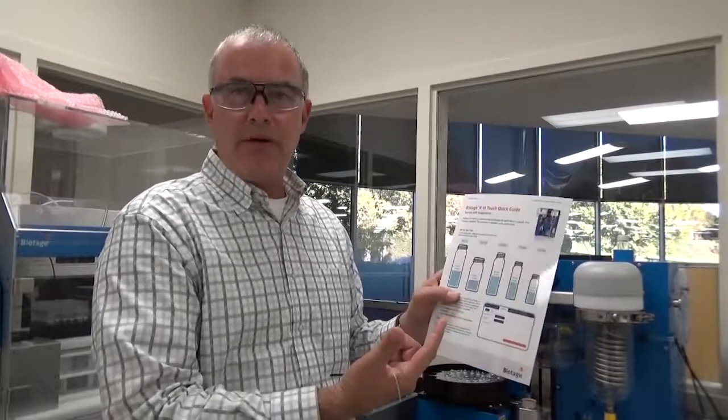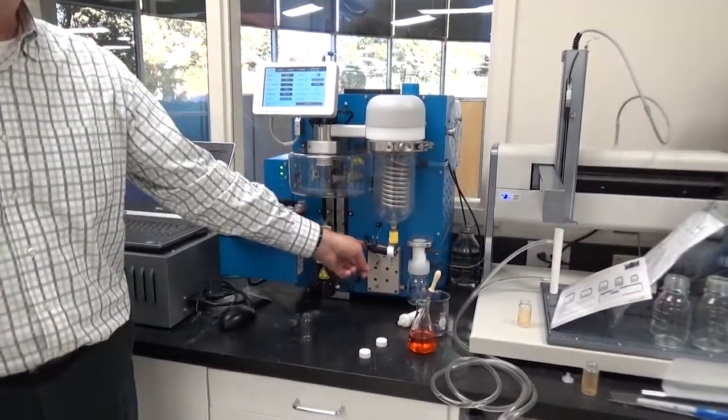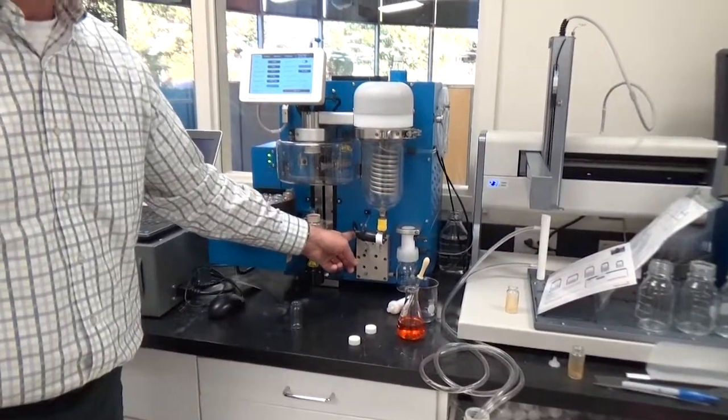Suppose you have more than 8 mils of solvent or 8 mils of reaction products to dry down. What do you do? Well, one of the options is this device right here, which is our solvent manager device. It's a pump with a bunch of valves that are controlled here within the V10 itself.